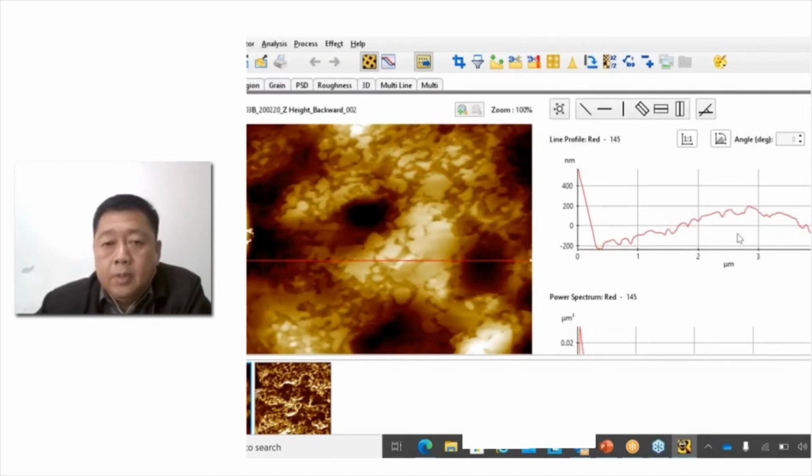This part is somewhere in the center here. You can see that this is the low, the lower part compared to both sides, which is around this area. Then you can actually measure the size compared to the scale here. So it's around 100 nanometers.